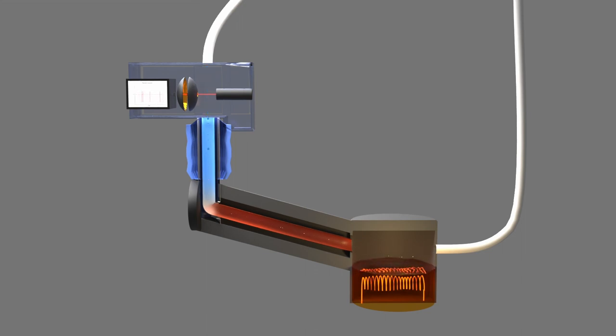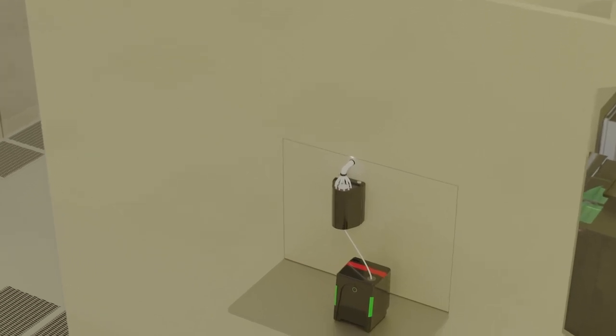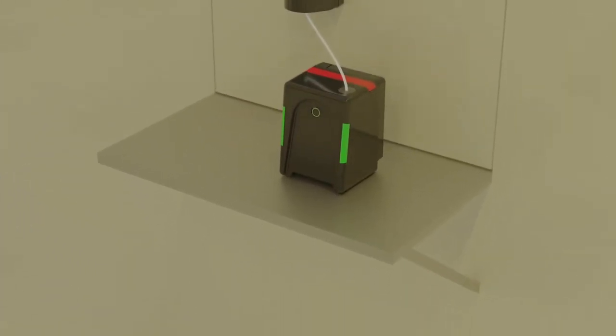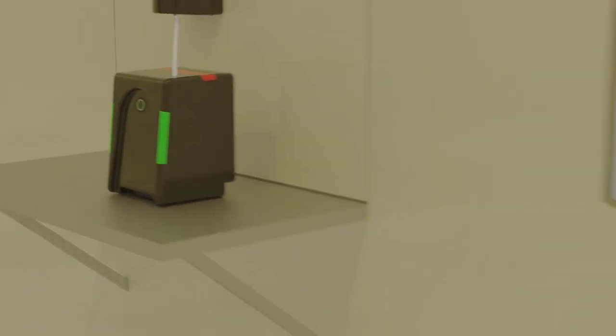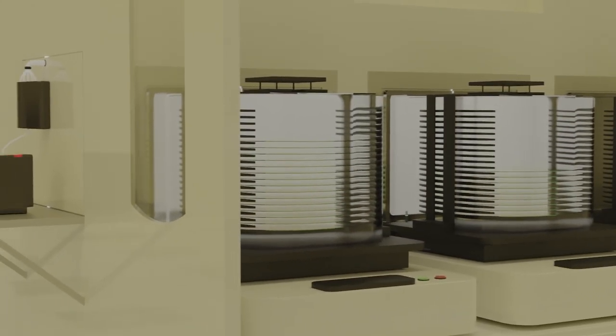The NanoAir 10 from Particle Measuring Systems uses CPC technology to enable the detection of airborne particles as small as 10 nm. With a 0.1 CFM sample flow rate and an industry-leading false count rate below 1.5 particles per cubic meter, the instrument has been developed specifically to enable nanoparticle contamination to be detected within cleanrooms and other ultra-clean environments.